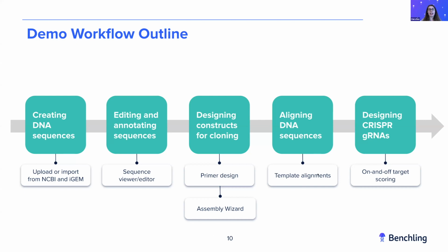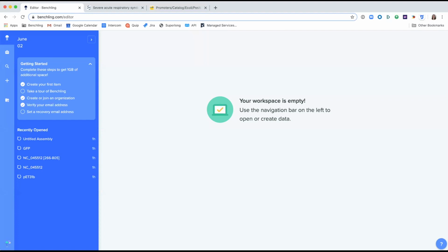So with that, if Johnny, if I could take over the screen share, I'm going to go ahead and move over into Benchling. Awesome. Okay. I'm going to hit stop sharing, or are you going to? There we go. All right, everyone.